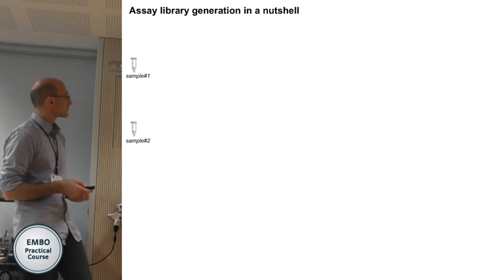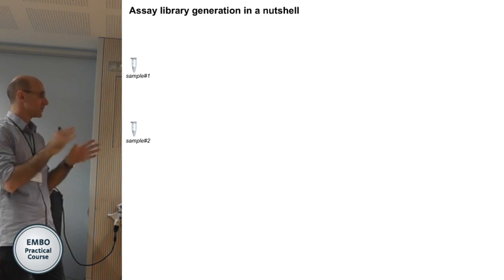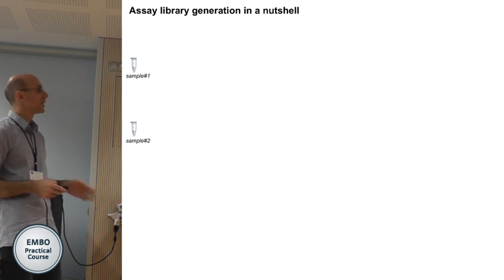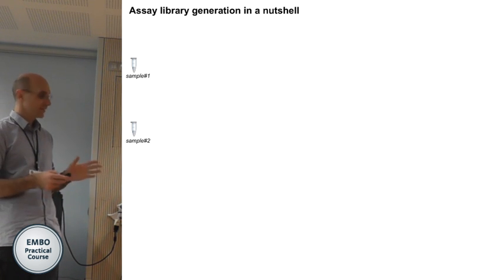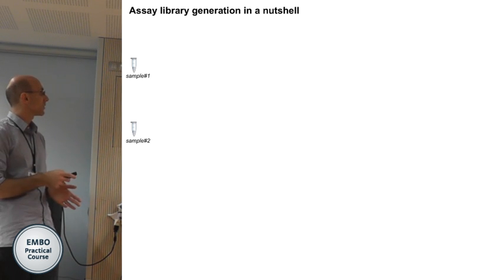So I'm just going to present you very quickly the workflow. This is nothing really complicated by itself, but it's a lot of little tips and tricks that you need to know a little bit.